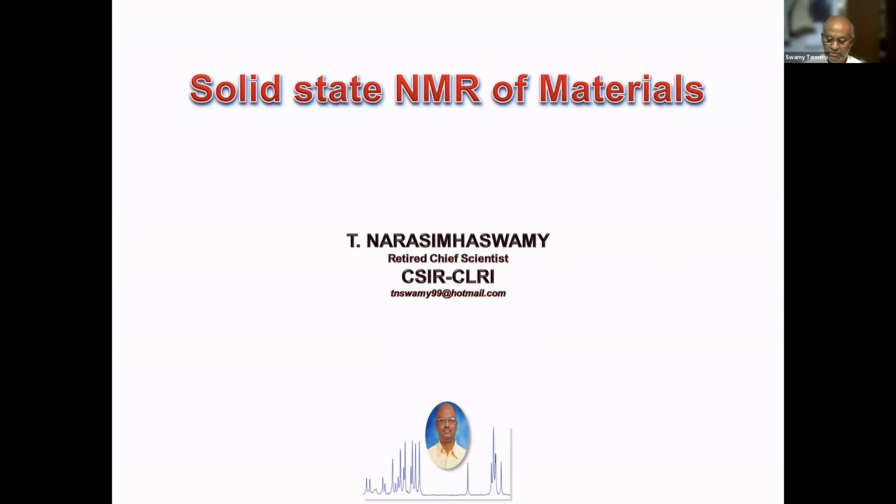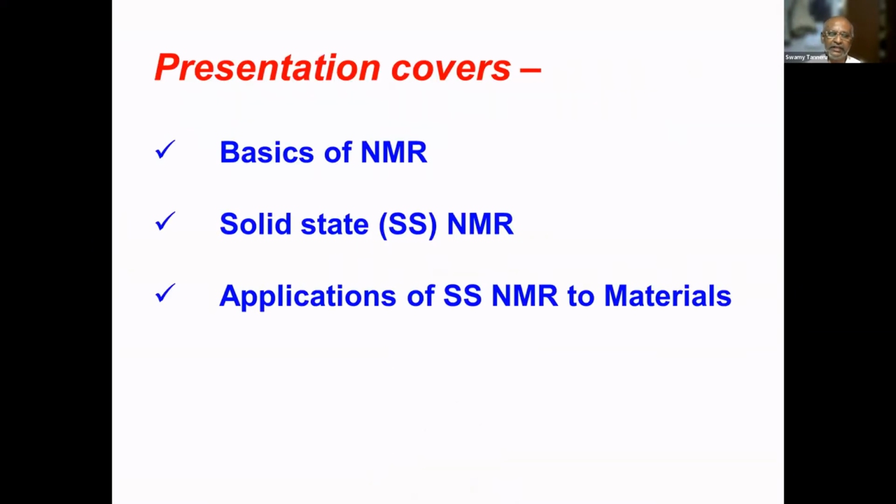So, in today's presentation, I will be covering a few basics of NMR. I understand that there are two speakers who are going to deal with NMR, so I'm going to touch only the essential part of it. Then solid-state NMR, why solid-state NMR is different from solution NMR, and applications of solid-state NMR to materials.